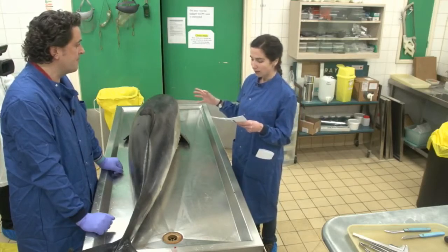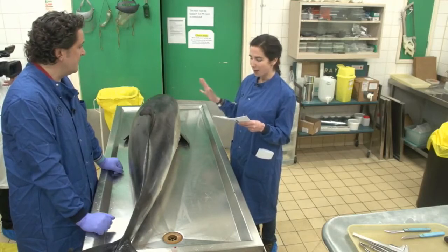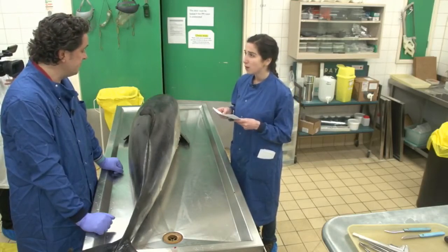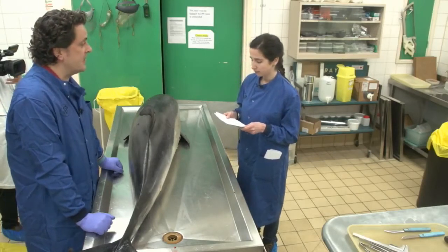It's a common dolphin. What's the background to this case, Rob? We do have a map showing where it stranded, and also a couple of photos of the animal on the beach. So this turned up at a place called Tor Abbey Sands in South Devon, near Torquay, I think, on the 23rd of February. It was found floating just offshore and then stranded. Local public, and we have reports from various parties as well, and it's picked up by the local authority, took it to their depot. We retrieved it, brought it back here, and it's been in our fridge ever since, awaiting attention tonight.